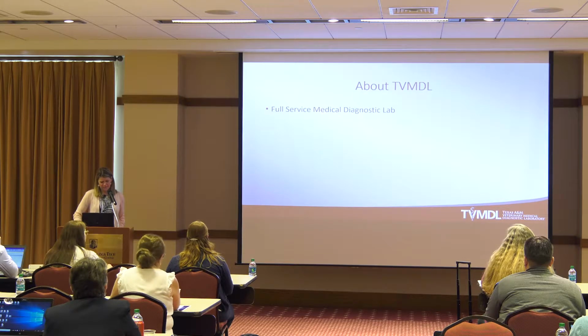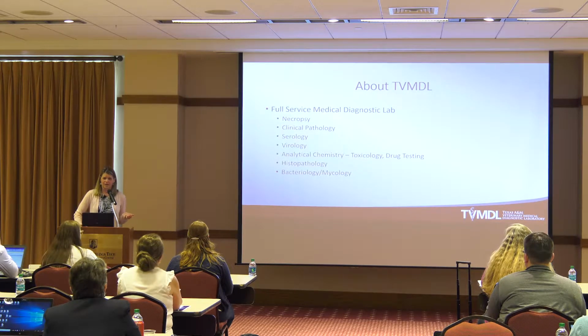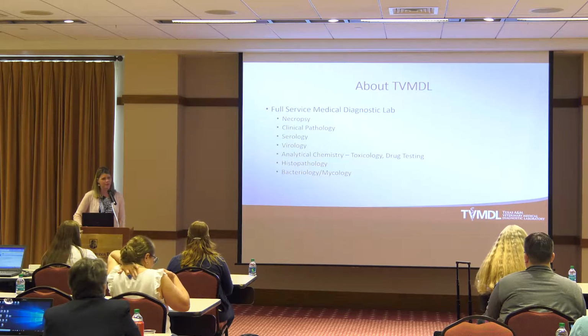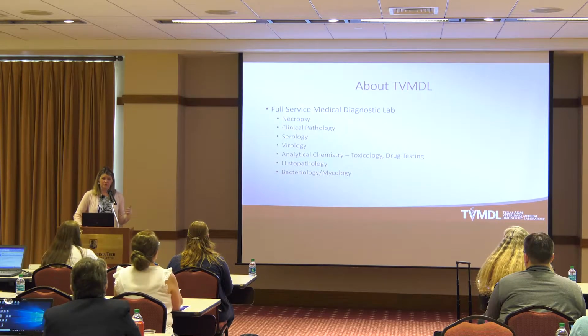So we are a full-service medical diagnostic lab. What does that mean? Basically, it means that we will, same as human diagnostics, if anyone's in the healthcare field. We have a necropsy, which is basically animal autopsy, if you're not familiar with that term. And then all the other sections, clinical pathology, serology, histopathology, we're in diagnostics. We're trying to determine the cause of a disease or the death of an animal. So just to give you a little bit of background about what we do, we also call these disciplines or sections. So you'll see in our Qualtrax setup how that comes into play.